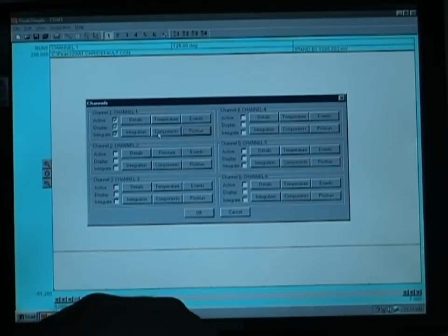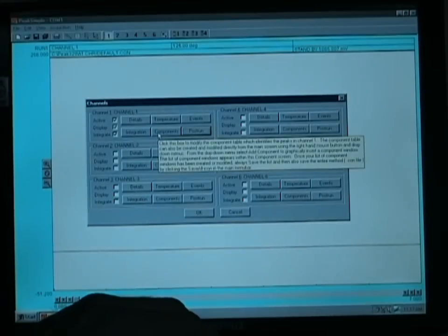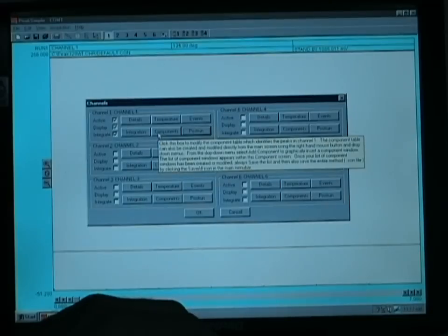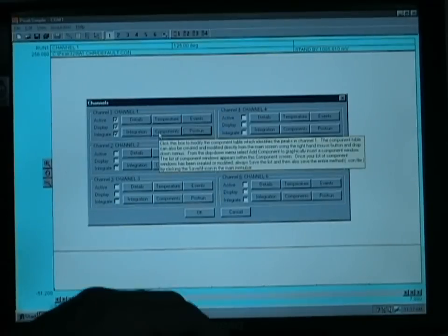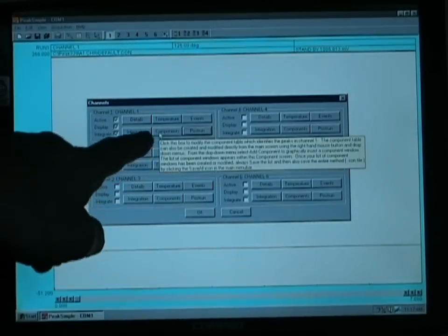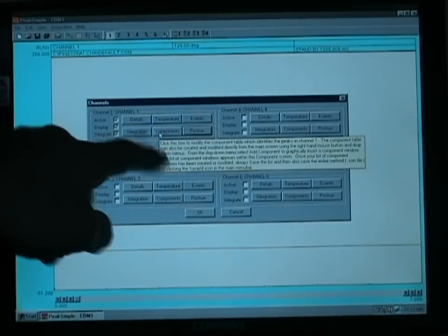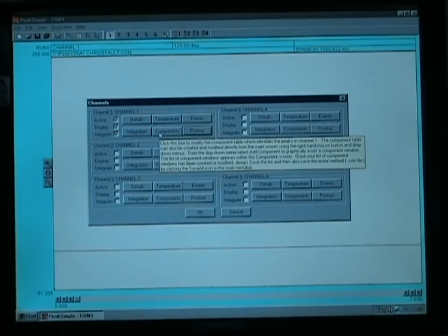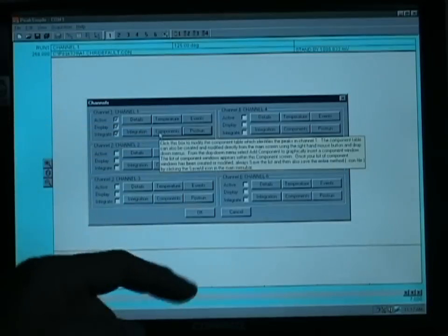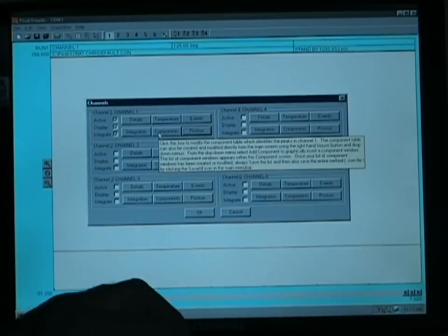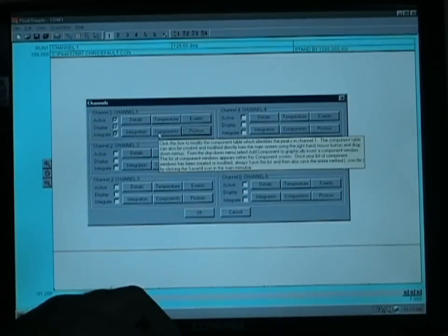We don't have a component file yet, but we will do so after running our standard, and notice as you leave the cursor near any of the options, an on-screen help will appear to guide you through the operations.